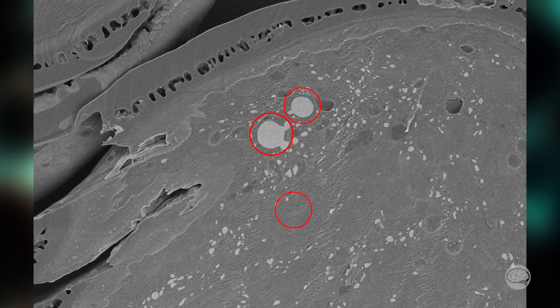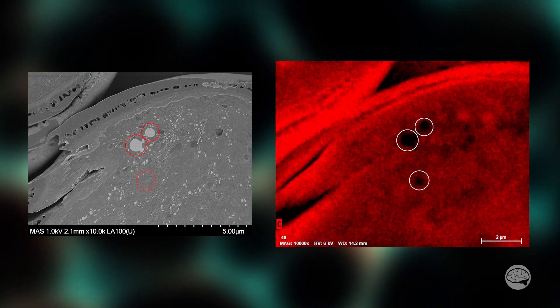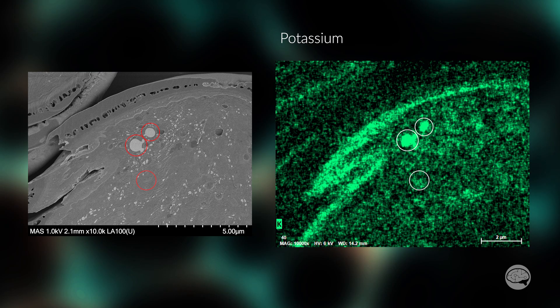So these three spheres are what we're really interested in. They're about half a micron in diameter, and the one right here at the bottom is just below the surface of the sample, so we can't see it very well in the secondary electron image. But at six kV, the beam is able to penetrate the sample far enough that we're getting plenty of EDS signal from it, and we will see it in the EDS maps. Going through all the elements in these spheres, we've got a distinct absence of carbon. What we do have is oxygen, phosphorus, magnesium, and potassium.